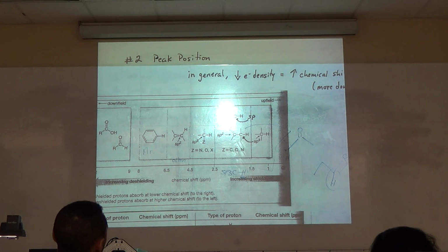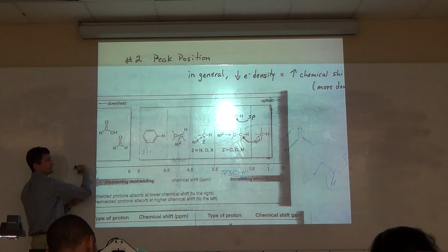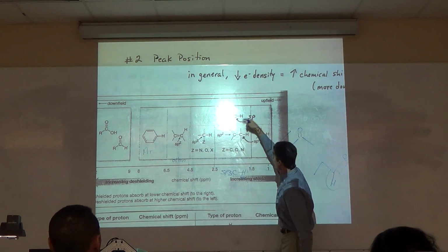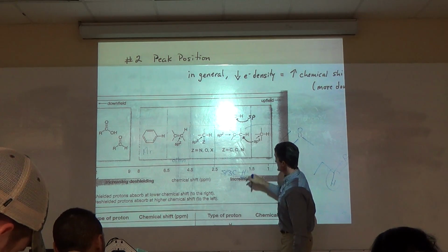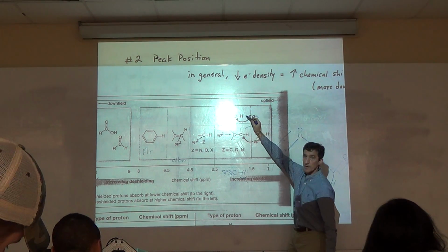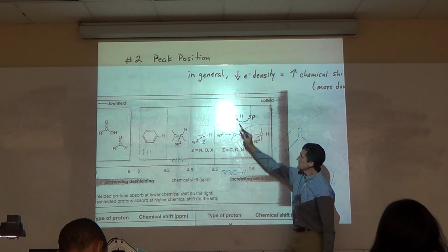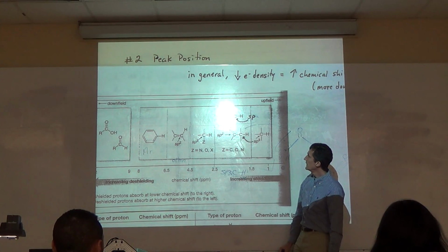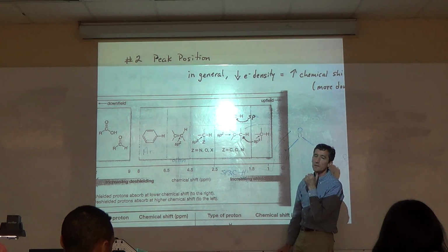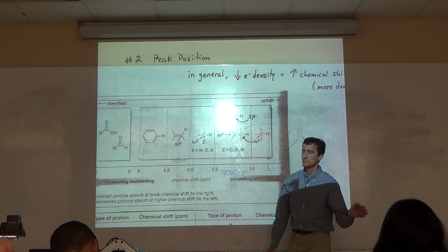So learn your regions. You might think that the sp CH is even further downfield, but it's actually back upfield with your sp3s. See, I said these are sp3s. But you also have this guy. It's kind of an outlier because it's not as commonly seen, but it's actually back up here. Let's explain that. The explanation introduces an important concept.